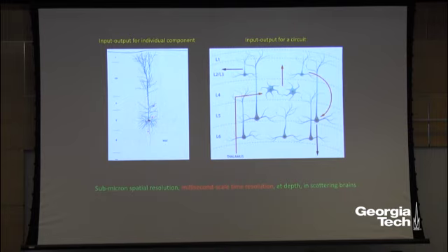Now, as I mentioned at the very beginning, the action potential happens on the level of millisecond scale. And it's really more desirable if we could image those action potentials or the membrane potentials at 1,000 frames per second. And as I mentioned to you before, obviously this is going to be difficult, right? It's even harder just to do the 3 dimension, and then we can do 30 hertz. But now you want to increase the scan speed by another 30 times. How can we do this?